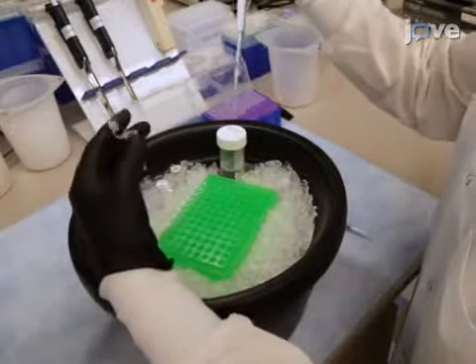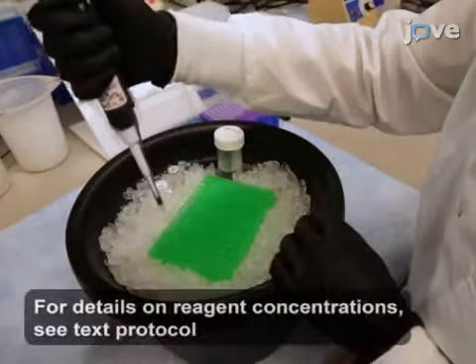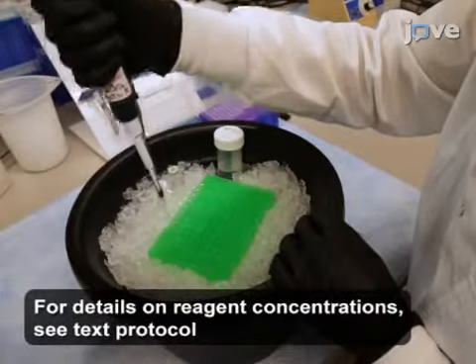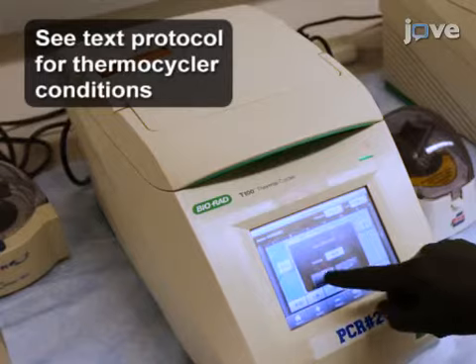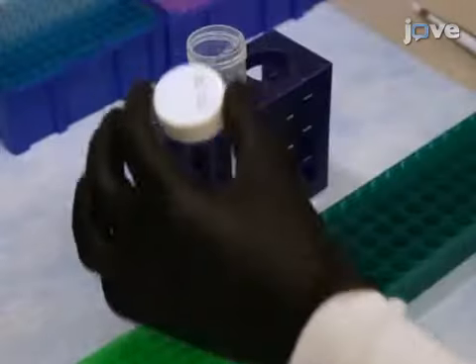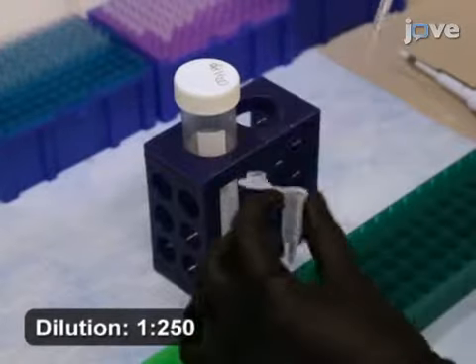To anneal and phosphorylate the oligos, add the reagents to a total of 10 microliters in a PCR tube kept on ice. Set the program in the thermocycler. Use water to dilute the reaction after the cycle is complete.